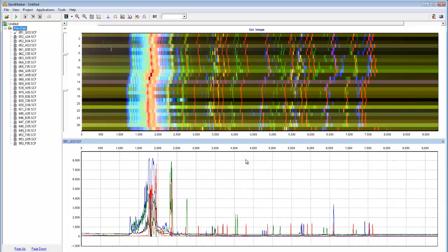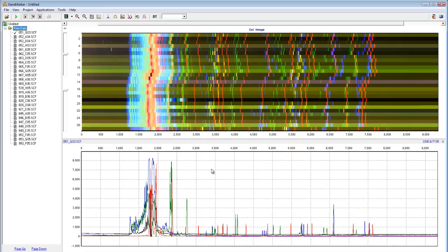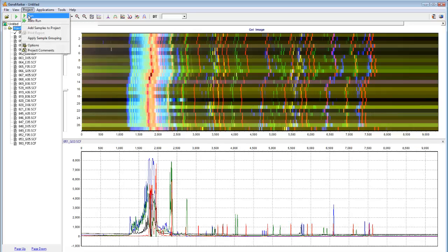We can now visualize the raw data, which is organized in a file tree to the left. Once you have reviewed your raw data and are ready to begin data processing, simply click on the green arrow or navigate to Project, Run.